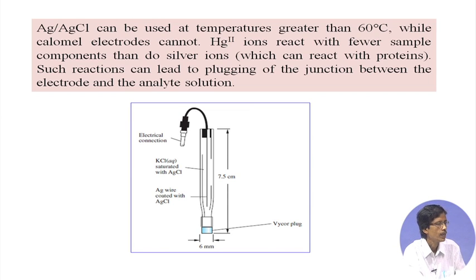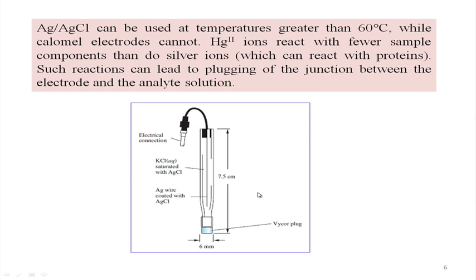That means your reference electrode and the indicator electrode, what we consider as the working electrode. When they are put together, we can consider them for measuring the concentration of the protons in the solution. That is your corresponding pH electrode or the glass electrode we call, because we use the glass membrane. So, the glass electrode we basically use for this.